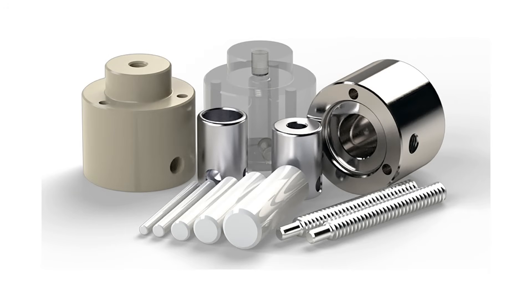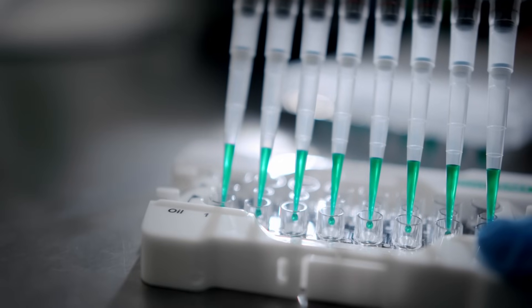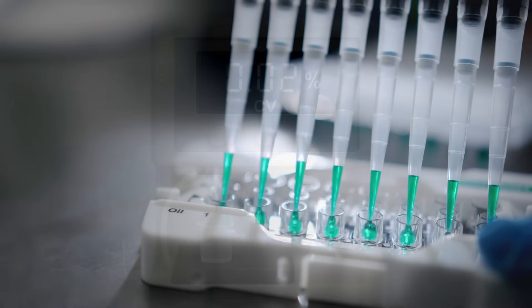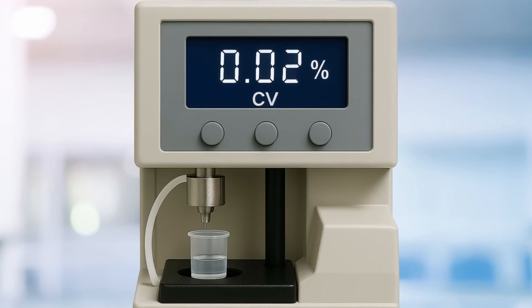What sets the Xacta apart? Flexibility. With a simple command, you can vary dispense volumes while maintaining extraordinary precision — less than 0.02% CV.